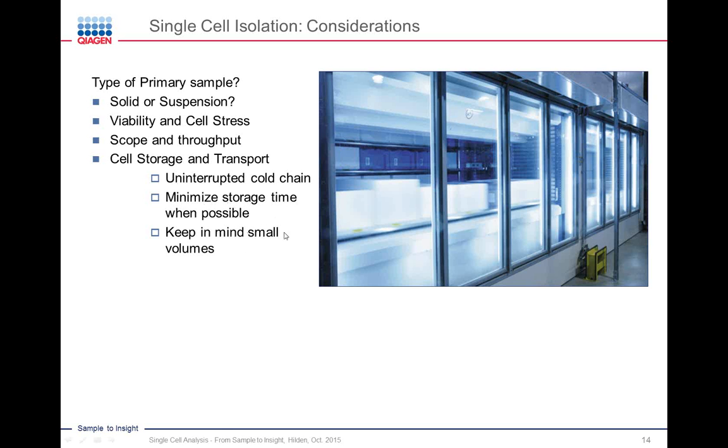And the other thing to keep in mind is that when you're dealing with a single cell, you need to, by necessity, have smaller volumes. You can't have a single cell in 1 milliliter and expect to recover it later.